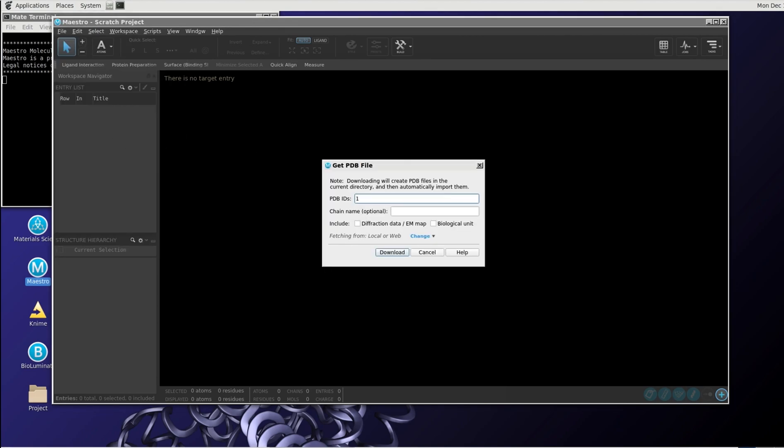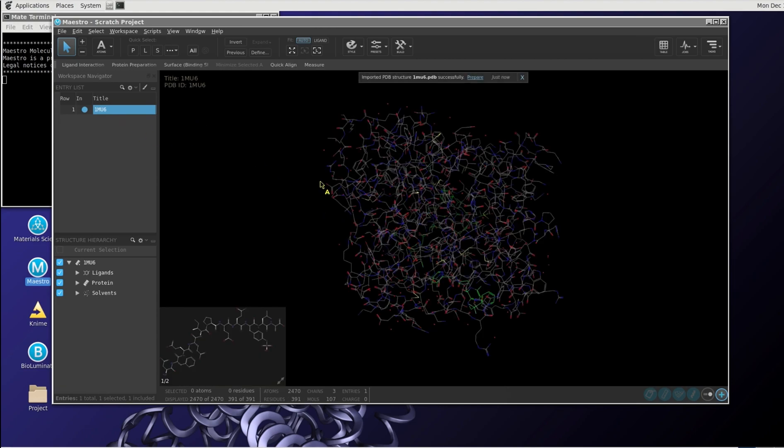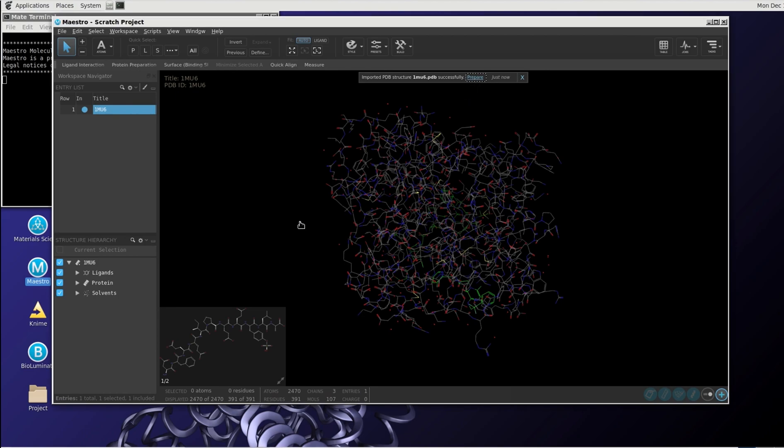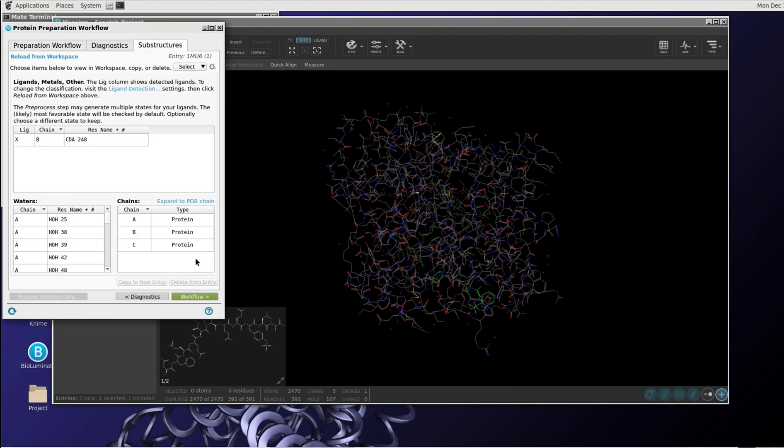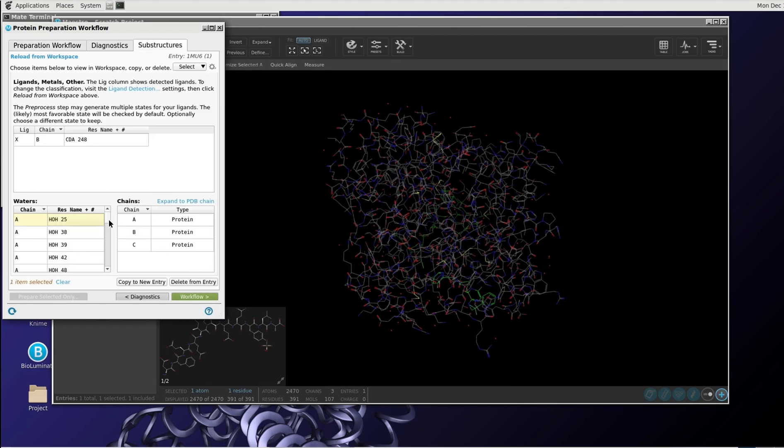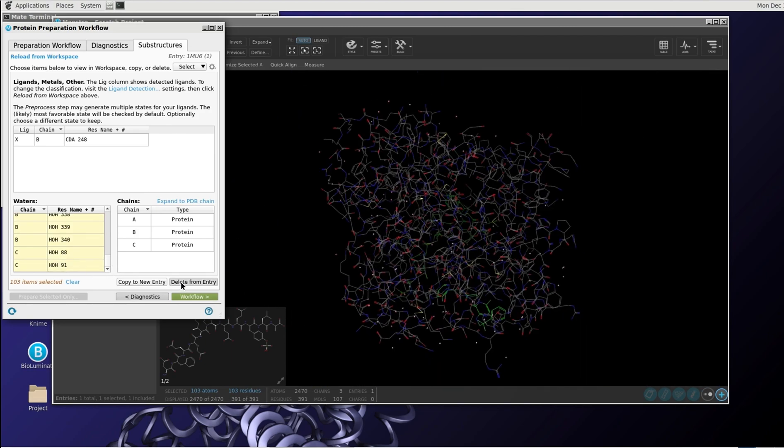1MU6 is the name that I'm going to use. Okay, so that has been imported. We can now prepare this protein. Let's have a look at it. First of all, we will delete all the water molecules. So we select them as follows and delete from entry.